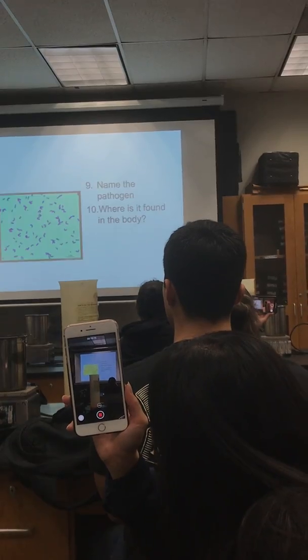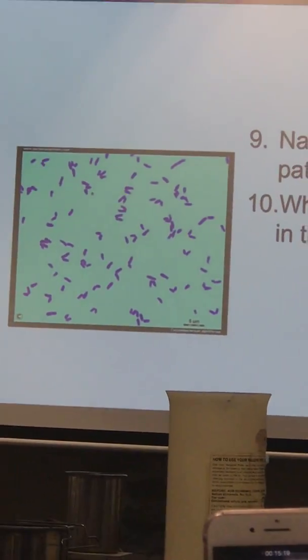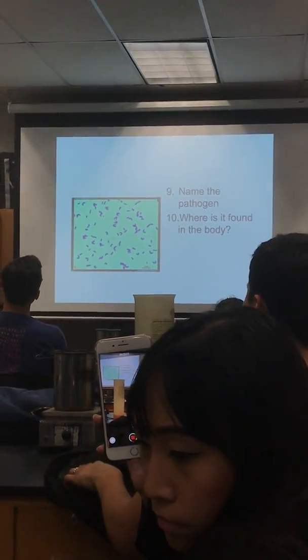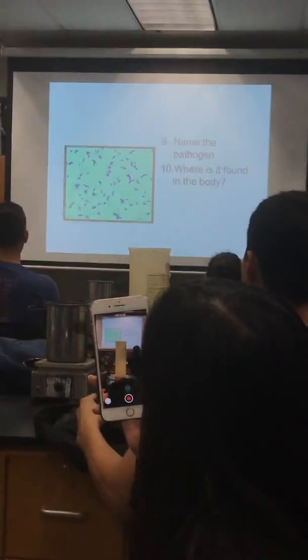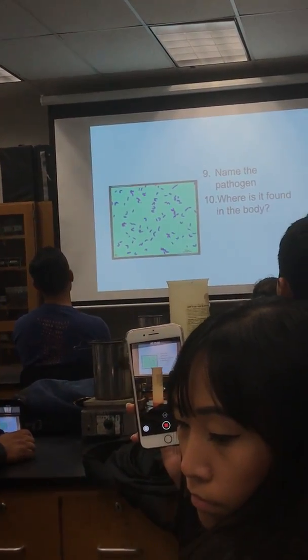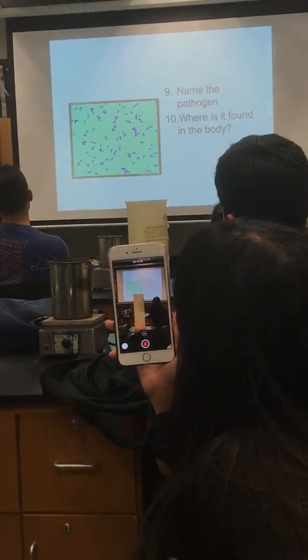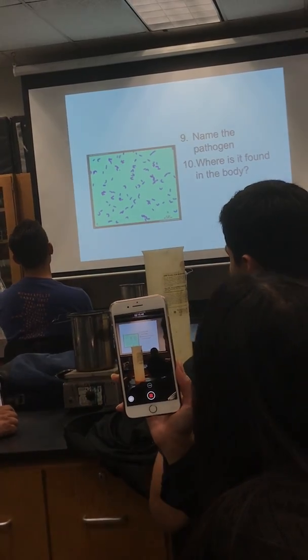All right, this is a little tougher. So tell me what you see. What is this organism? Shape, gram reaction. Do you see endospores here? Anybody? No? It's a gram-positive rod. Okay, so what's the organism? It doesn't form endospores.